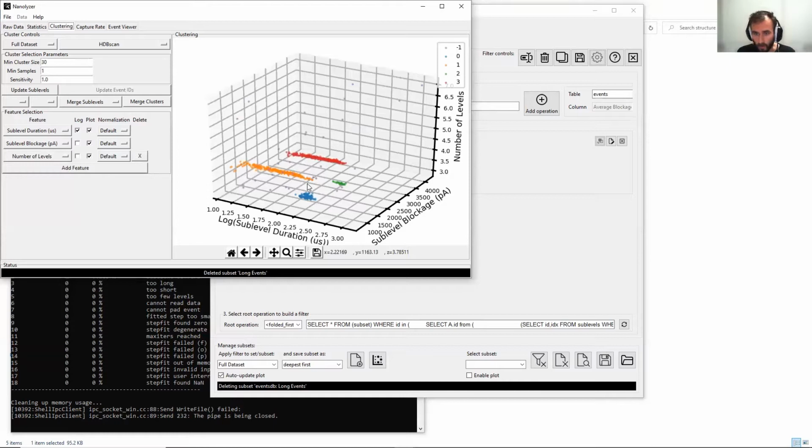The sublevel labeled 1 in orange is the folded level in events that contain 4 sublevels. Remember, this includes 2 baseline levels, so that would be an unfolded level in a partially folded event. The sublevel labeled 2 in green is the folded level in events that are completely folded. And finally, the red sublevel labeled 3 is the folded level in events that are partially folded. Just through a couple of clicks, we've really broken down our sublevels into exactly what they mean within each event. And this is relatively simple to do.